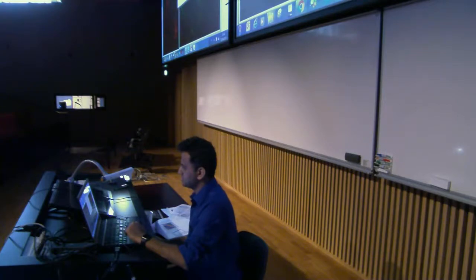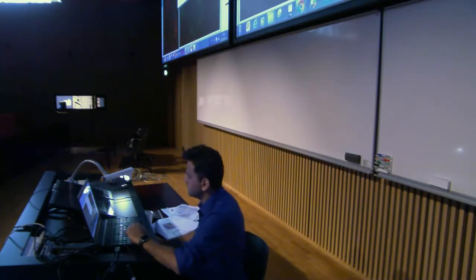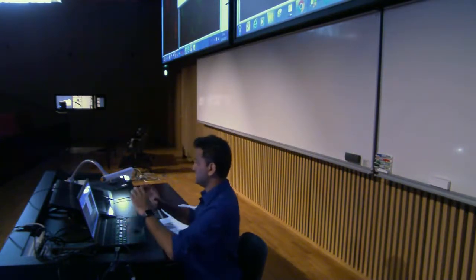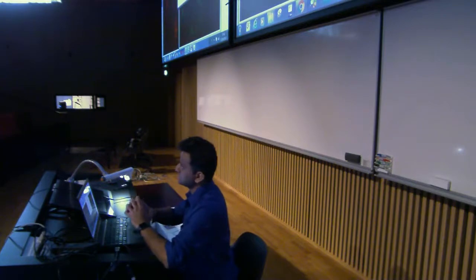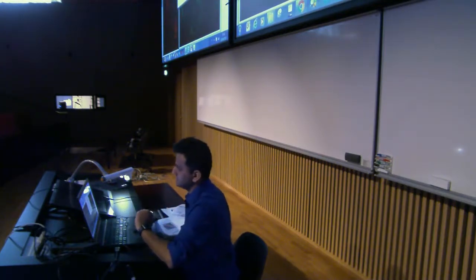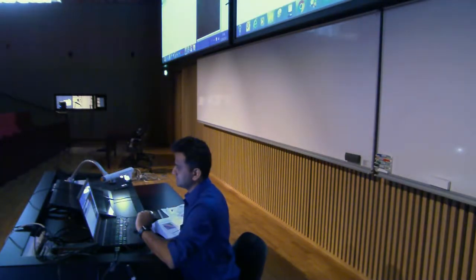It's asking me what is your red channel, which is my C1, and C2, my green channel. Do you have any ROI? It is also possible to only find the co-localization within the region of interest. That's also possible if we had the third channel. Show the co-localization pixel map, all these parameters, and show also the scatter plot, because just by looking at the scatter plot, one should be able to know if they are co-localized or not. And say okay, now it does something.